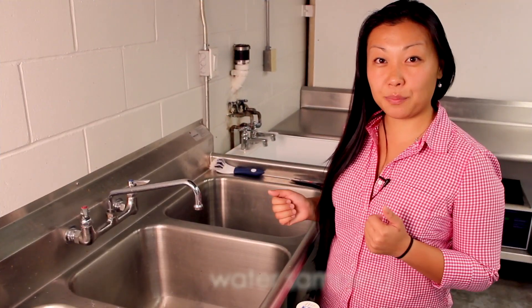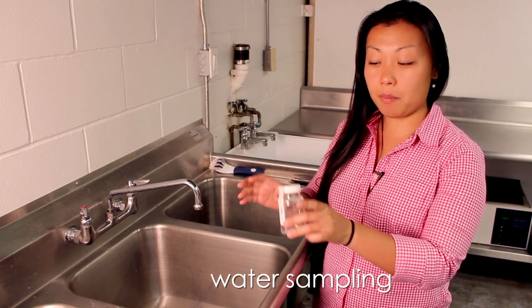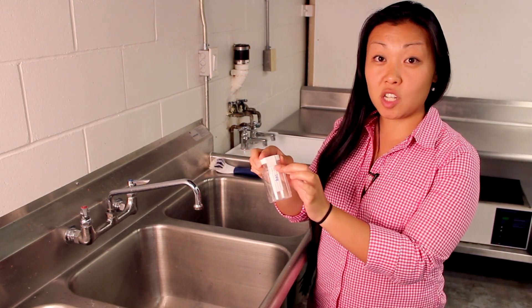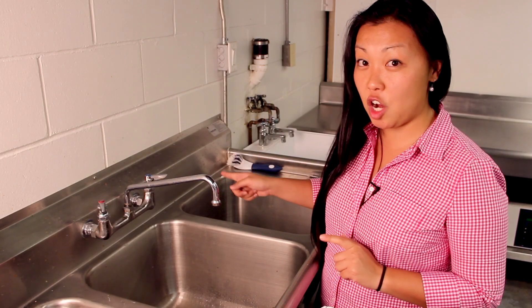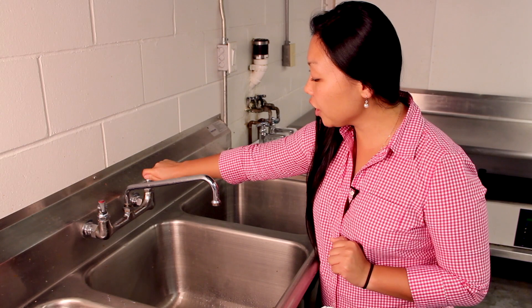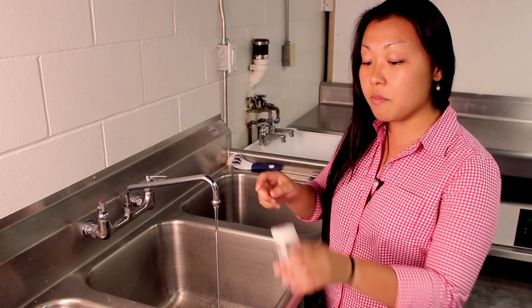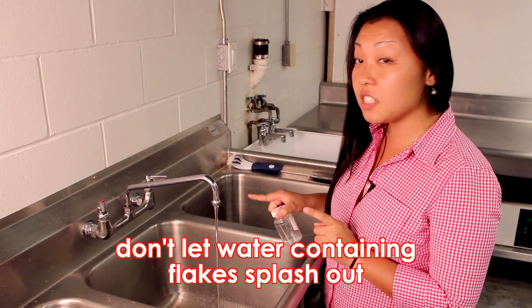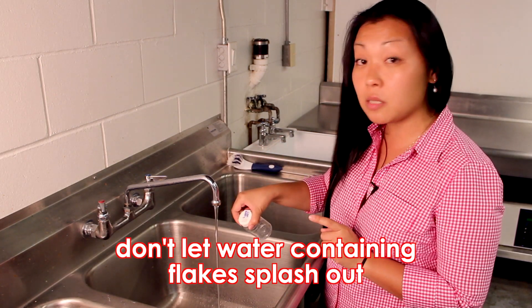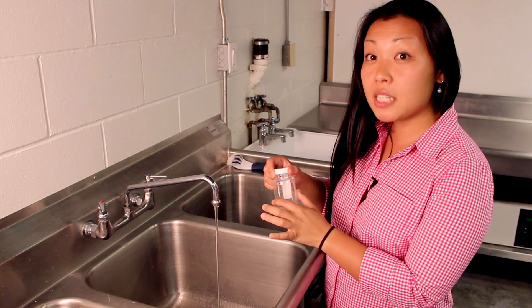Now I'm going to show you how to sample your water. First, check your specimen cup and make sure the seal is not broken — that way you know it's not contaminated. Before you break that seal, turn on your tap ever so slightly. The reason is that those white flakes in your specimen cup mean that if the water flows too fast, you'll have water splashing out. Now it's time to break the seal.